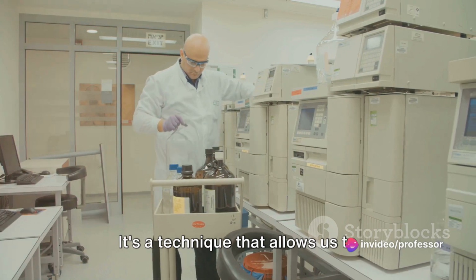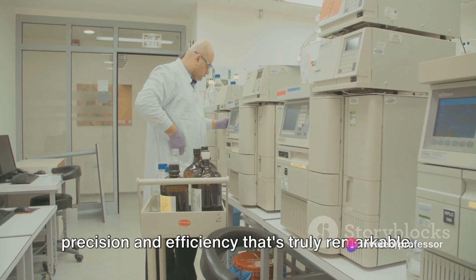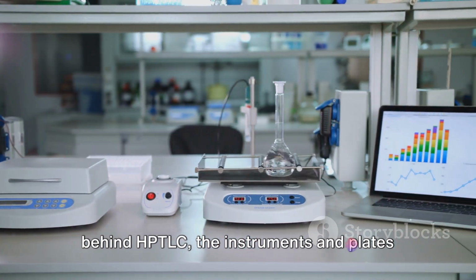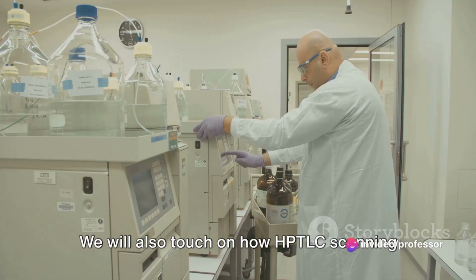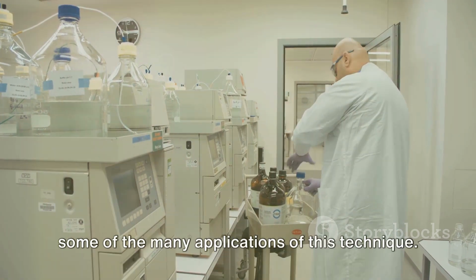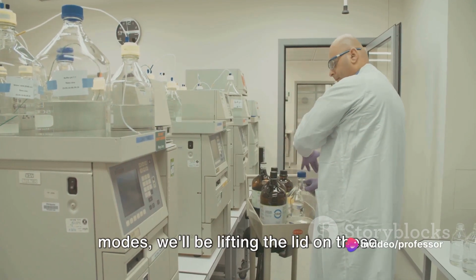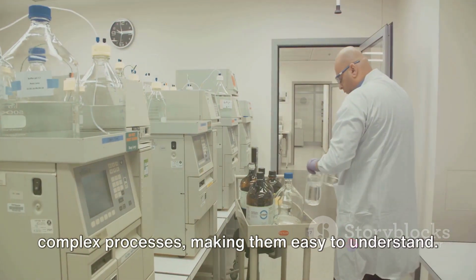It's a technique that allows us to separate and identify the different components within a mixture, with a precision and efficiency that's truly remarkable. In this video, we will explore the theory behind HPTLC, the instruments and plates involved, and the various development techniques used. We will also touch on how HPTLC scanning and evaluation takes place, and look at some of the many applications of this technique. From automated multiple development to horizontal TLC and other development modes, we'll be lifting the lid on these complex processes, making them easy to understand.